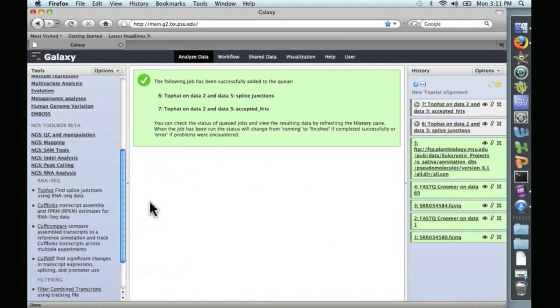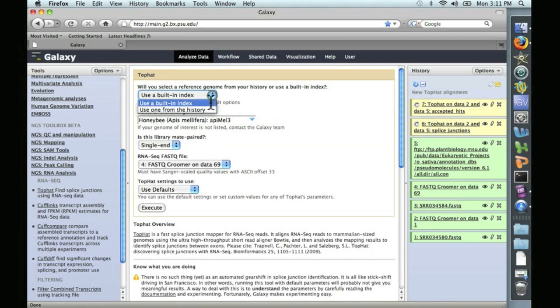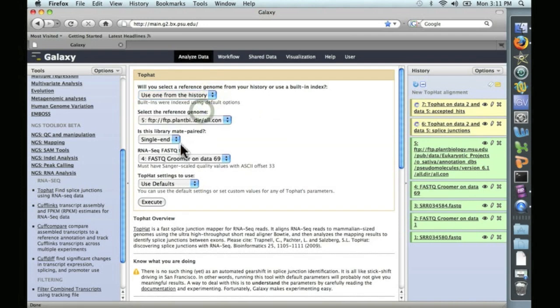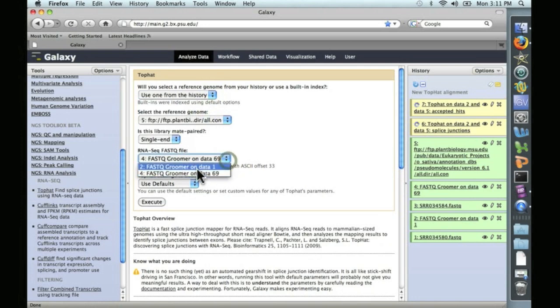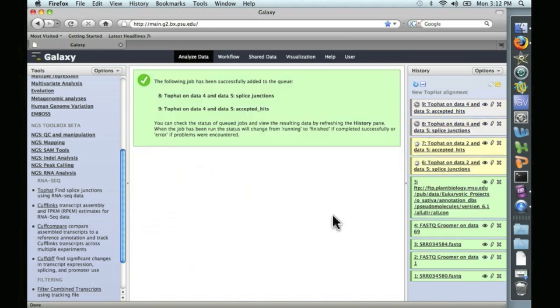This time, however, I'm not just going to go away. We're going to go ahead and queue up the second TopHat run as well. So in Galaxy, you don't have to wait for each step. You can put everything into a queue and run it at a time. So for the second one, we'll use one from the history, and this time we'll choose the second dataset. We'll click Execute.